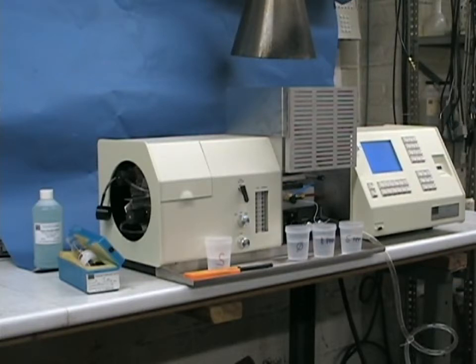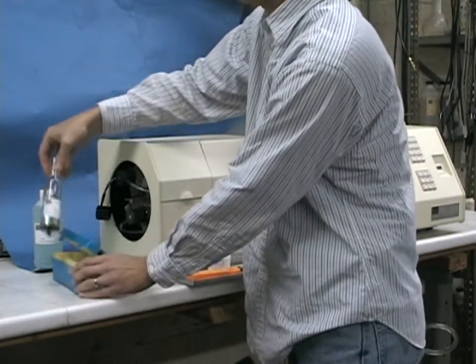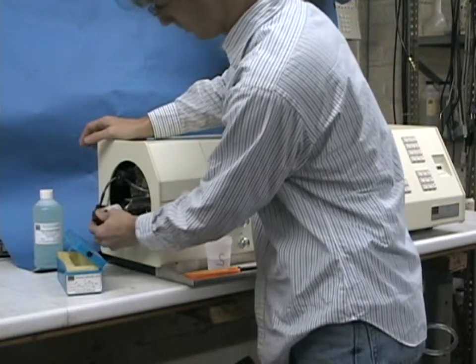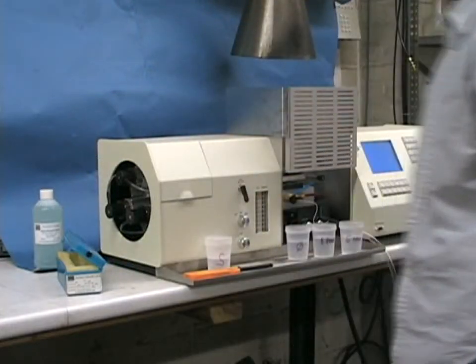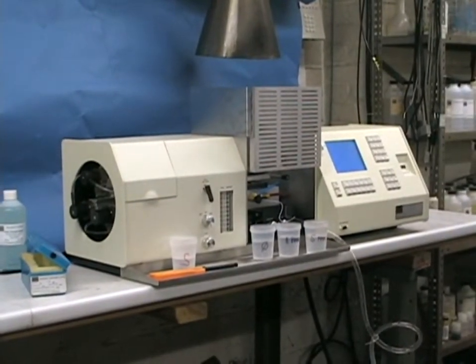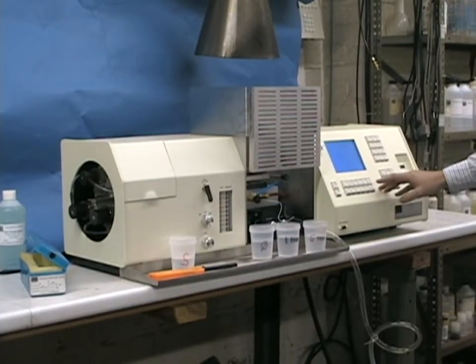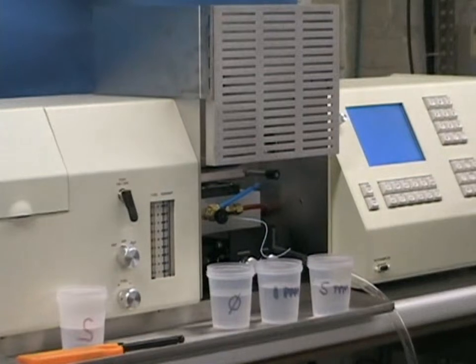Before any atomic absorption analysis, you must select the hollow cathode lamp for the element of interest and insert it into the turret so that it can be powered up and brought into alignment with the flame. Once that's done, you will go to your library, and using the keys according to the procedure, select the element that you want to do for this particular analysis.